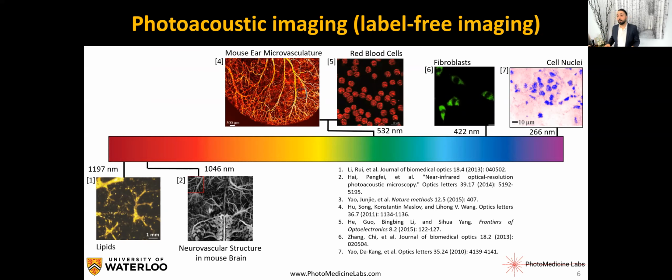So this is exciting because now we have a unique imaging contrast, which is optical absorption. And this is unique because there are not many other technologies that can actually do that. For example, X-ray, MRI, ultrasound, all those medical imaging techniques that we are familiar with are very exciting, very amazing, but they use a very different imaging contrast.